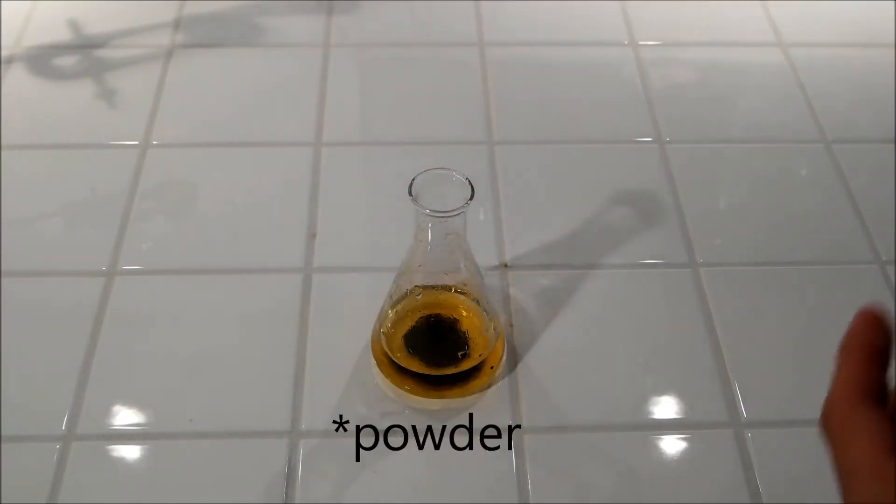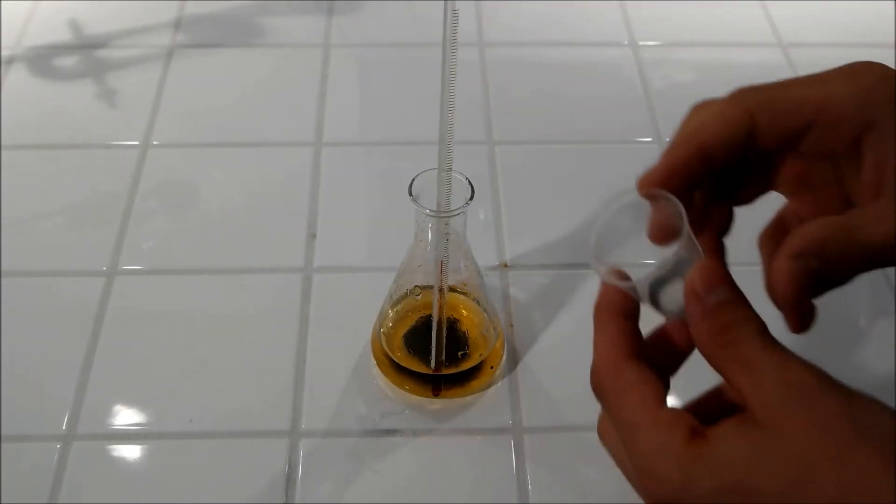Now add the zinc powder and put a thermometer in the Erlenmeyer flask.